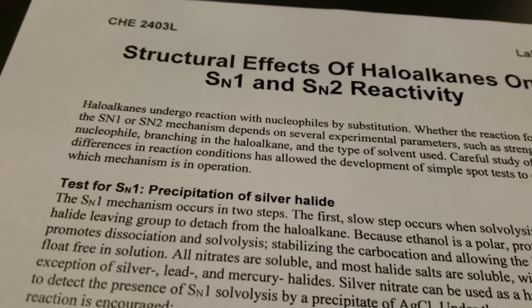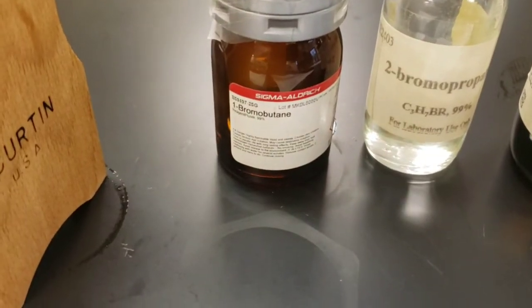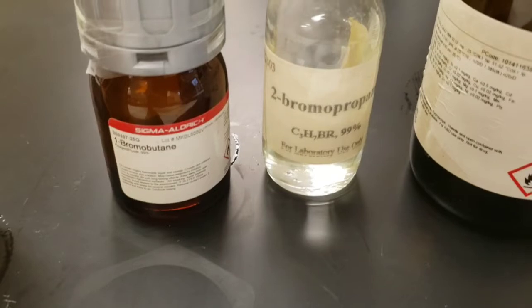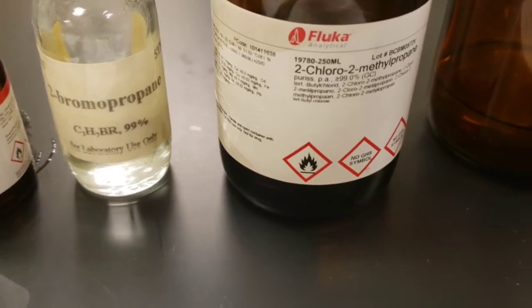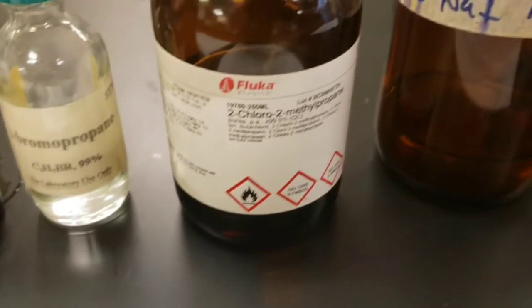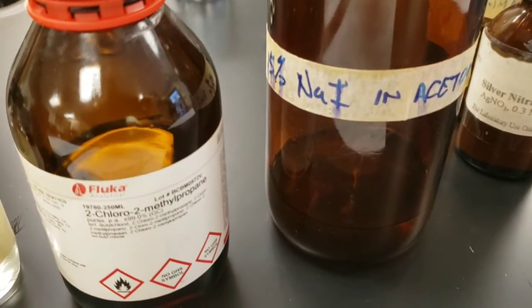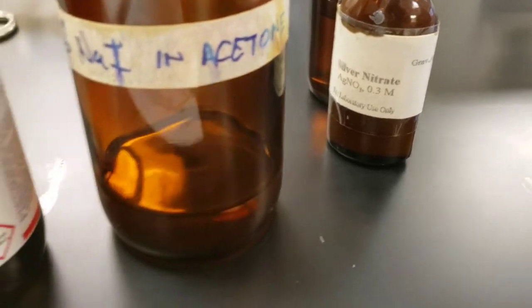For this experiment, you will need a primary haloalkane. This one is 1-bromobutane. A secondary haloalkane. This one is 2-bromopropane. And a tertiary haloalkane. This is 2-chloro-2-methyl-propane. You will also need some sodium iodide solution in acetone and silver nitrate solution.